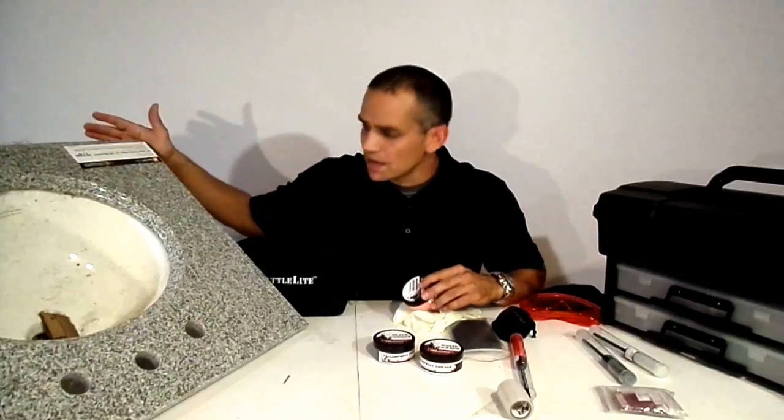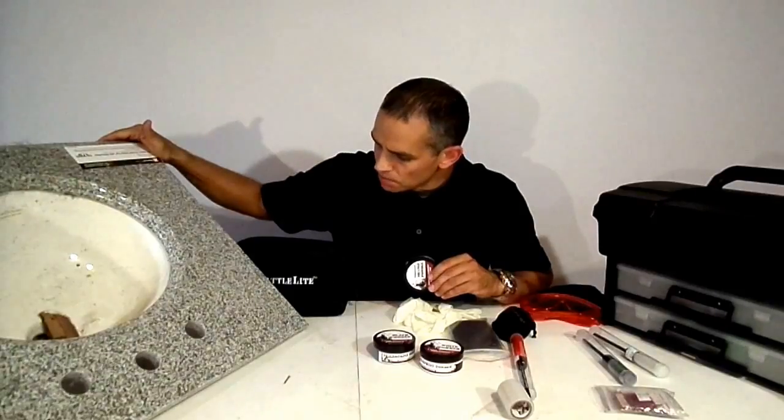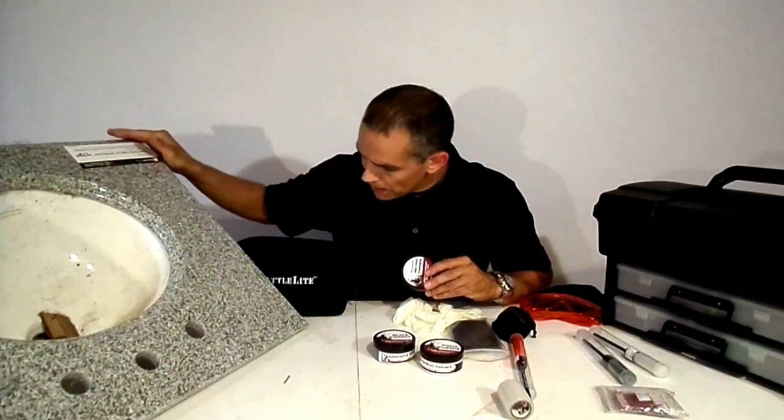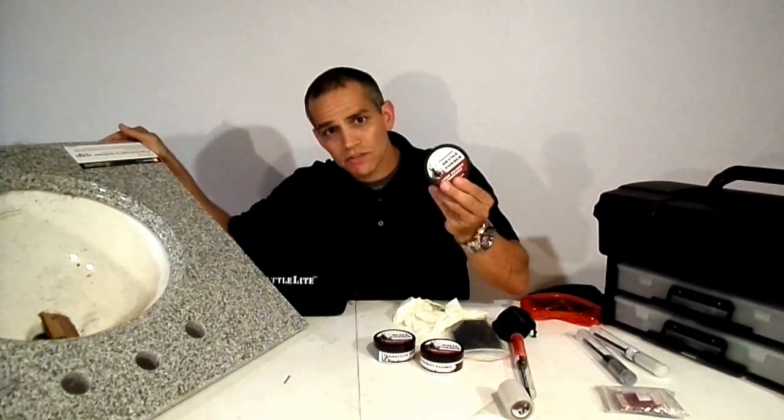I was fortunate enough when I was driving around, I found this on the side of the road — it's a granite marble sink. It has gray, white, and a little bit of brown in it. So when you're trying to develop this with a white powder or a black powder, you're not going to get those rich details that you're really looking for.